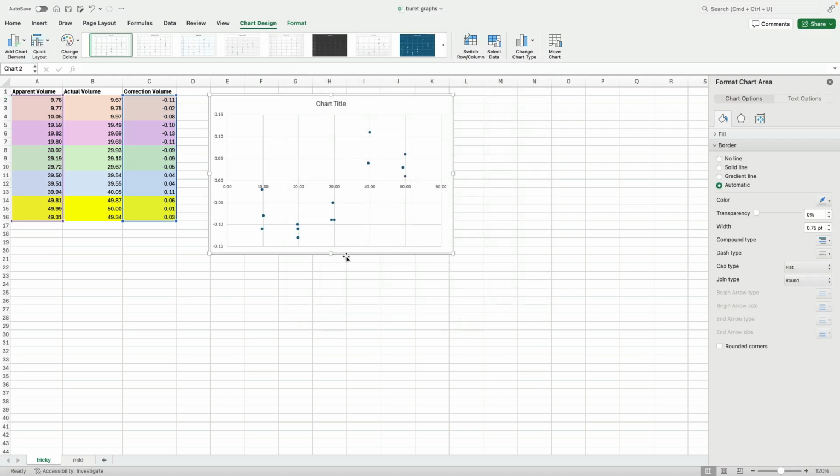So this is not great, as you can tell. You look at this and you're like, how do I know where to draw the lines? This looks random. And it's true. It does.